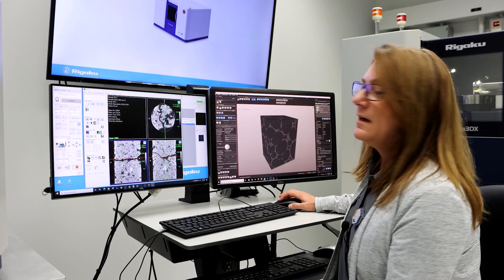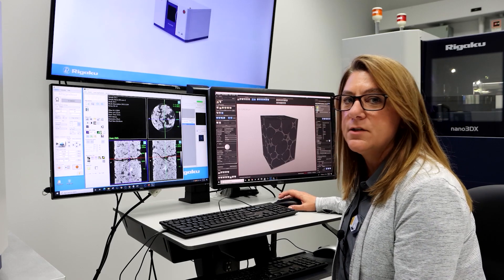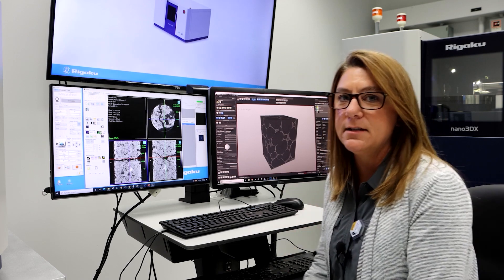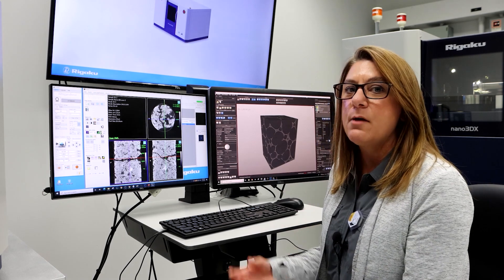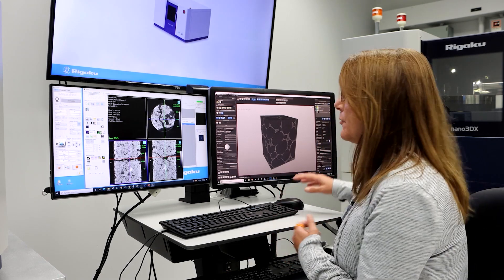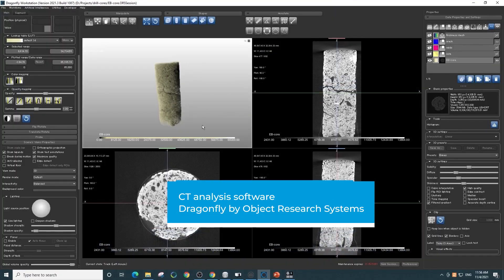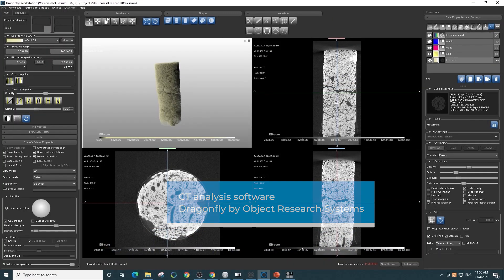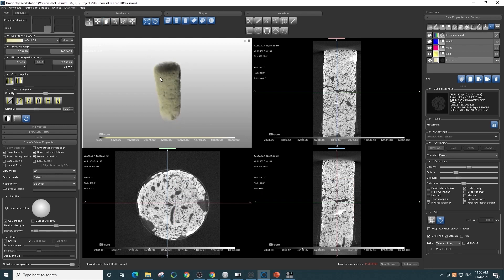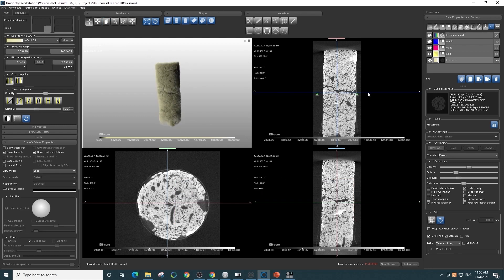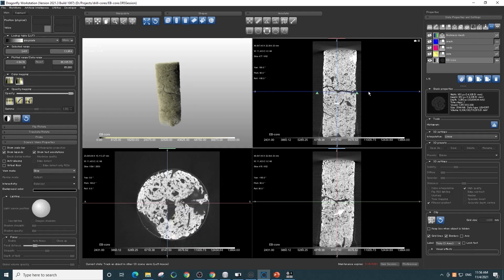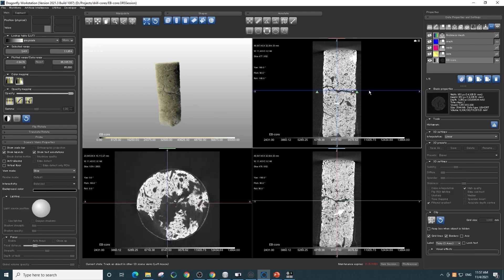If we wanted to do some quantitative analyses on this image, we can import it into another piece of software. Here is the drill core loaded in the software, where we have a 3D volume view as well as our 2D cross sections. We can look closely at the crack — in the bottom left view we can see the crack that is being interrogated here.